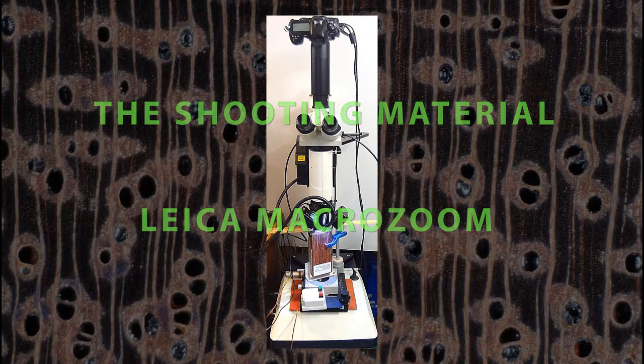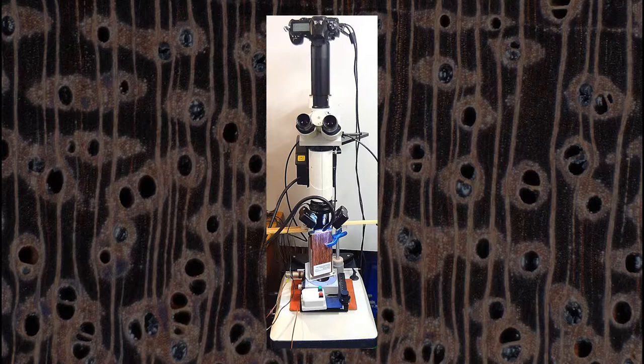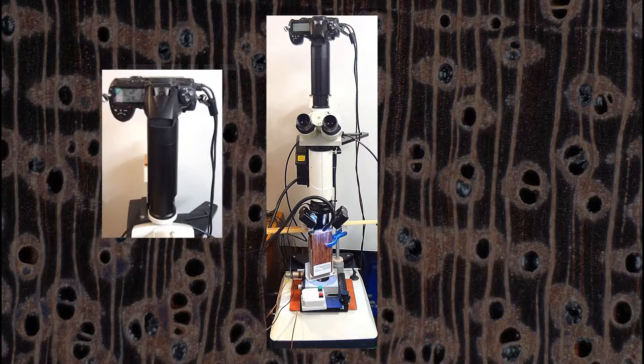Pro-zoom. It presents like this. It is composed of five parts. The first is the camera.